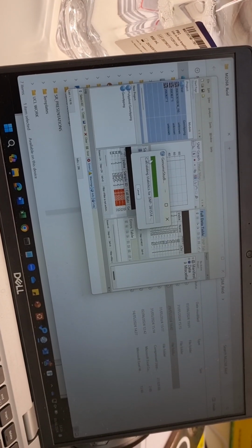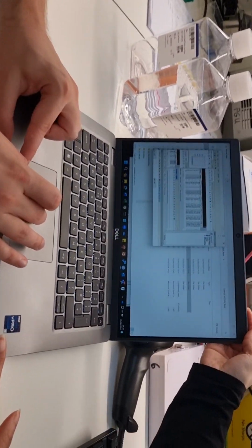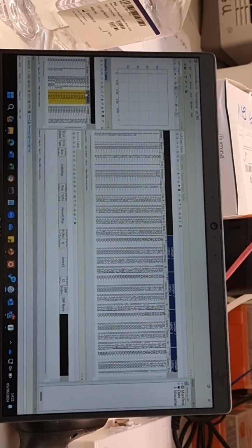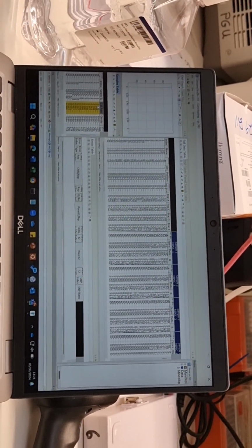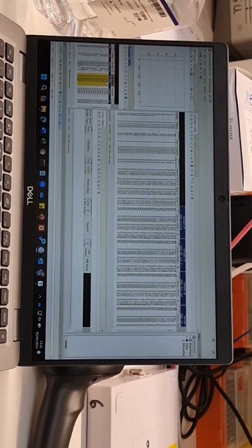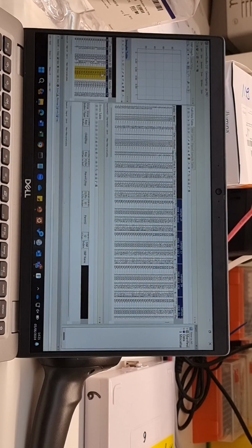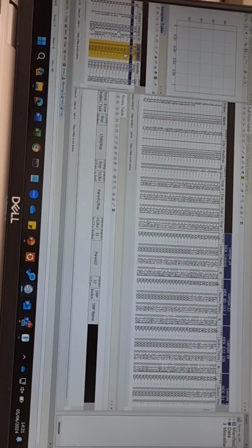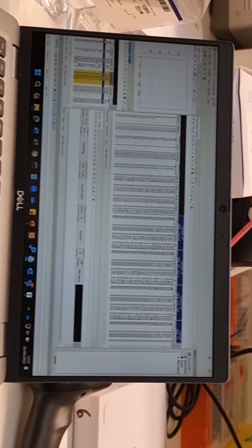I'm just going to open this up to check that the call rates are good enough. If you click on this call rate section here and then go up, that one's failed, but anything above 95% is a strong pass. So 95.8 there, 95.9. Yeah, good. They should all be okay.